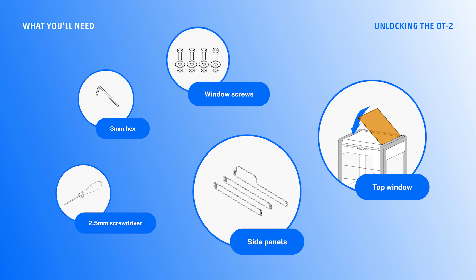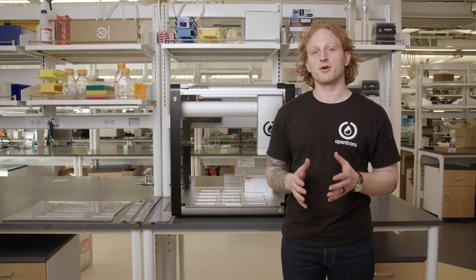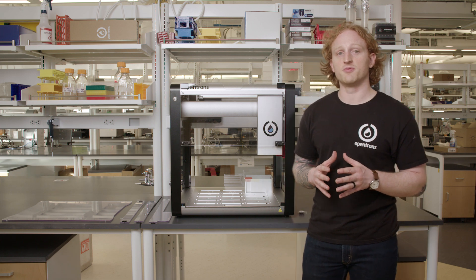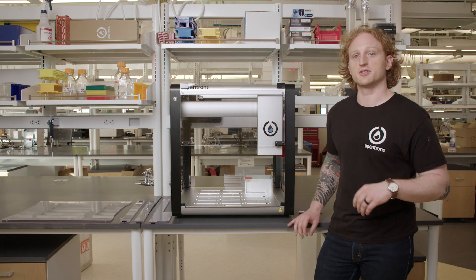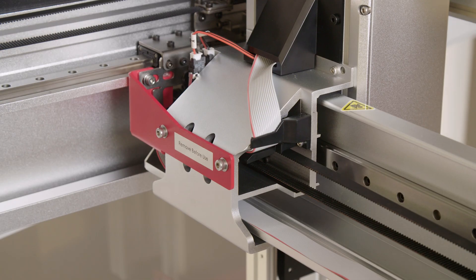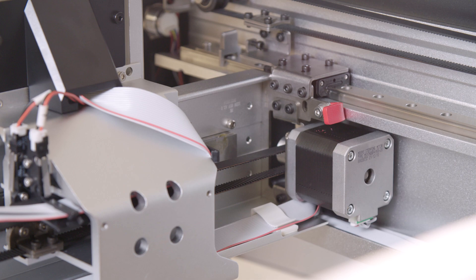To prevent damage during shipping, the moving parts of the OT2 are locked into place with three locking brackets. I will need to remove the brackets before turning on the OT2 for the first time. If I try to turn on the OT2 when these brackets are not removed, the robot will not function properly.